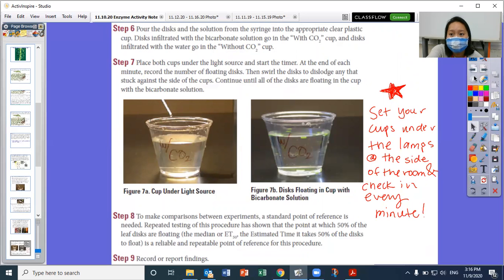Okay, and then here's a note: I'm not going to be using natural light, just because in my room there's no good natural light, since the sun doesn't really hit the windows here at all during the whole day. So I'm going to be using a fluorescent lamp, which is the same thing that people use when they grow plants indoors or in the dark, so that the plants get enough radiation to get light energy and store that light energy.